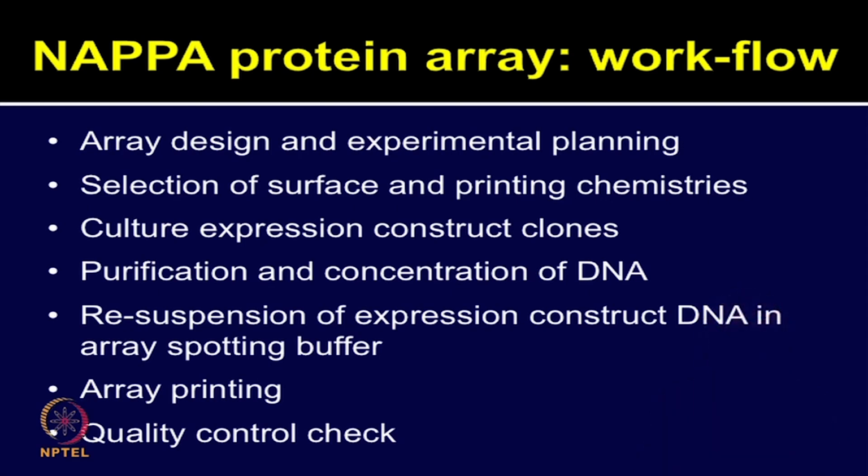What type of surface one needs to select and what printing chemistry one needs to use are different questions which are always on the minds of microarray researchers. Since we are talking about the cell-free expression based system, you need DNA to start with. So, how to express those and construct those clones are other considerations.